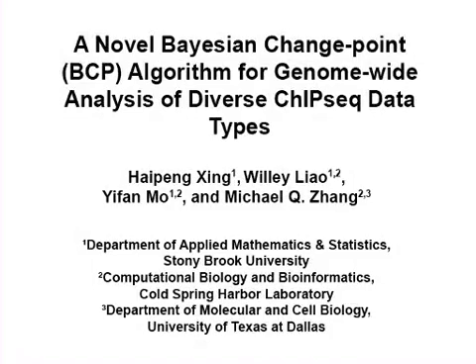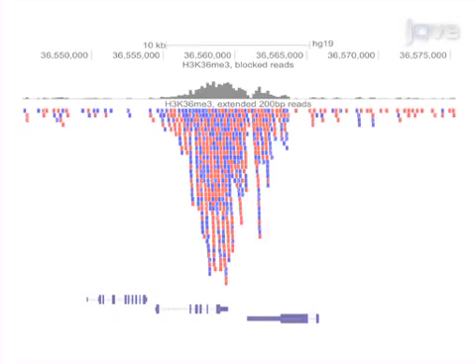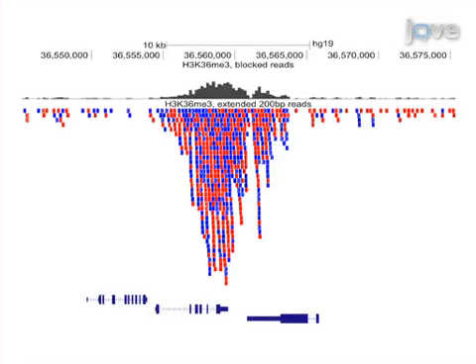The overall goal of the following experiment is to utilize the density of mapped read positions from chromatin immunoprecipitation sequencing data to estimate the posterior mean read density across the genome. This is achieved by pre-processing the mapped ChIPseq reads into blocked density profiles with the same number of reads falling within 200 base pair non-overlapping bins. Any adjacent bins with the same density are merged into a larger block.